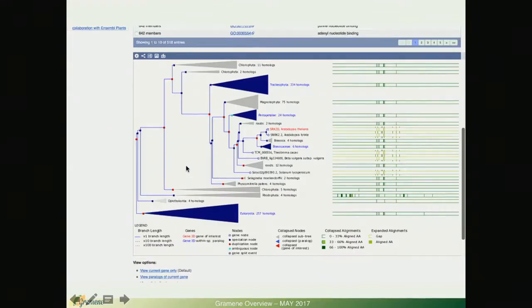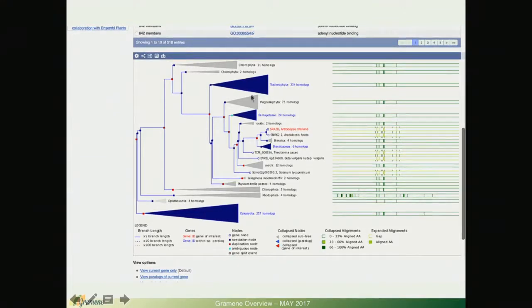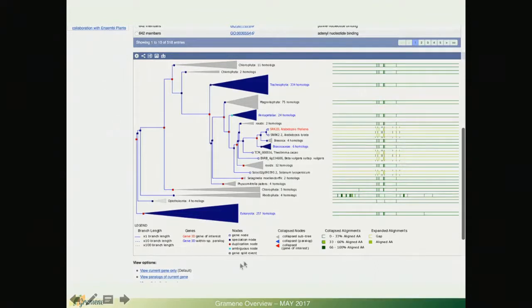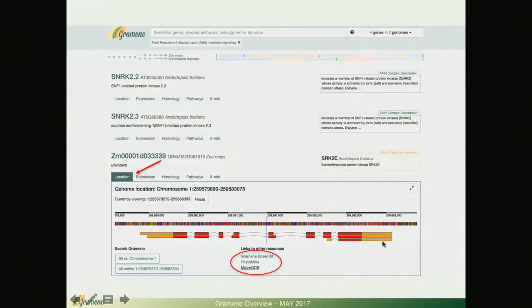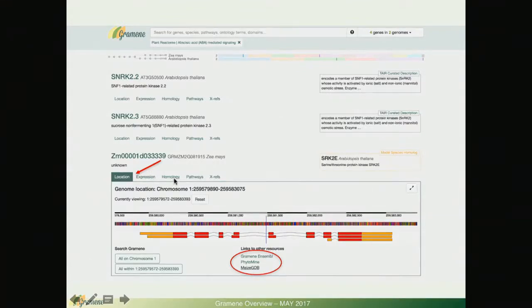This is how it looks like in the Ensemble browser and again just like in ours, collapsible nodes and some annotations.